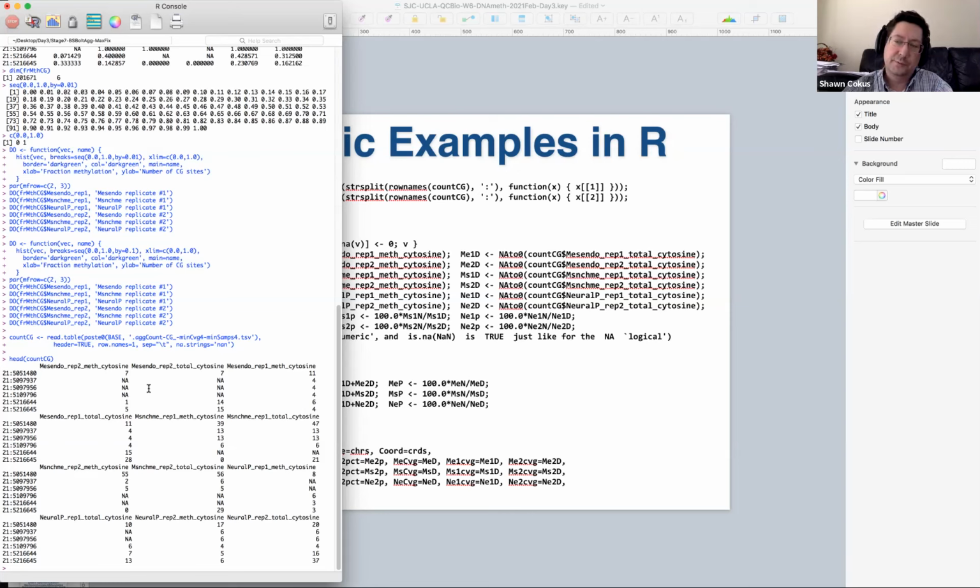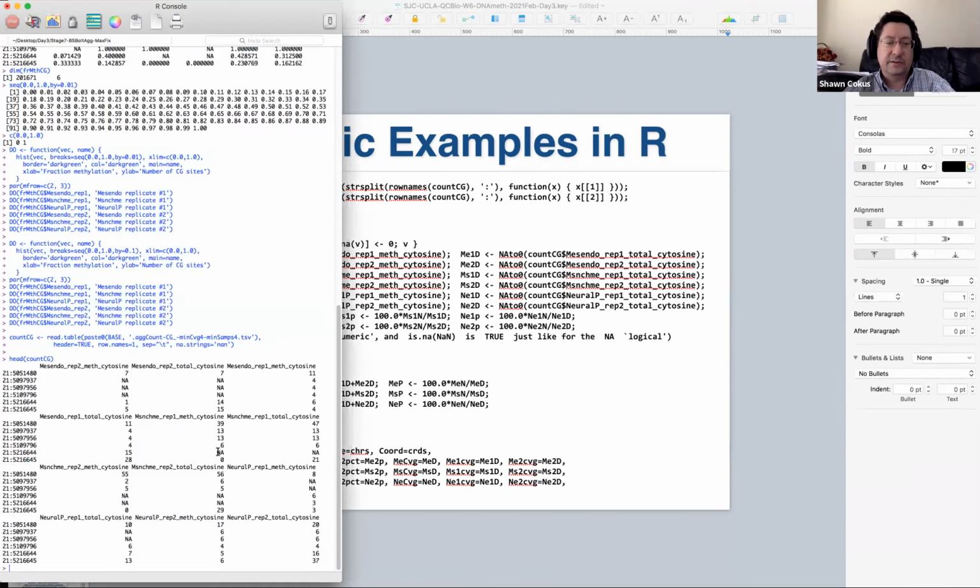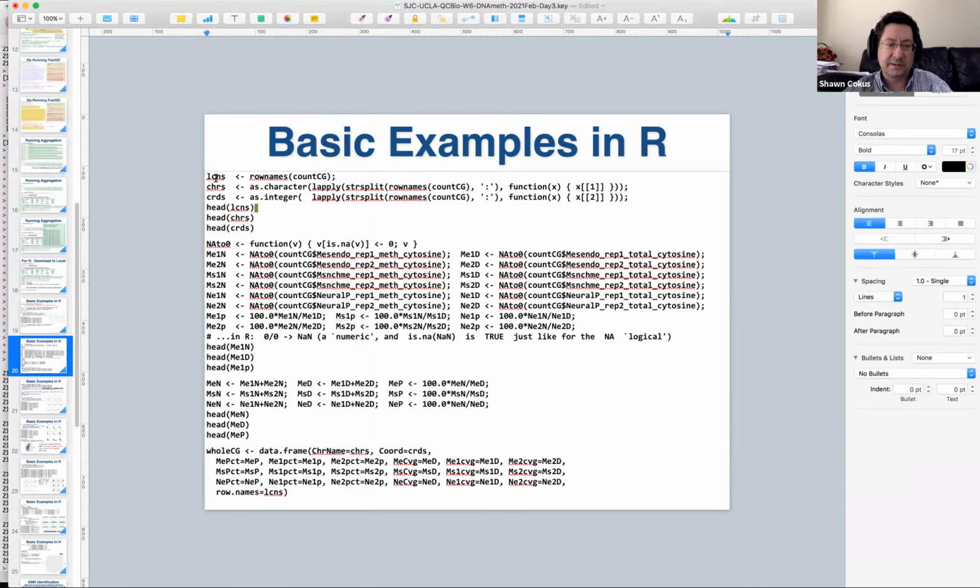And I'd also like to pool by replicates, right? So I'd like to keep replicate 1, replicate 2, and then the pool. So let's rearrange this business. Also, to do some of the plots later, I need those chromosomal coordinates as numbers, not as strings mushed up with the chromosome name. So here's a whole bunch of transformations we're going to do.